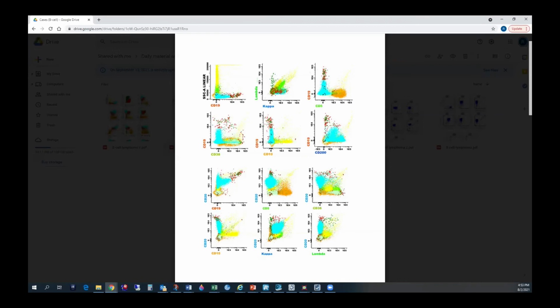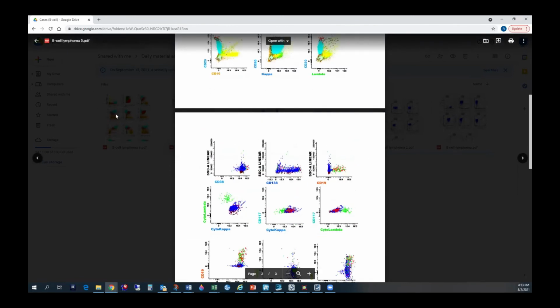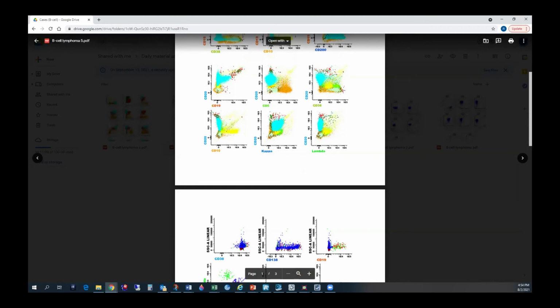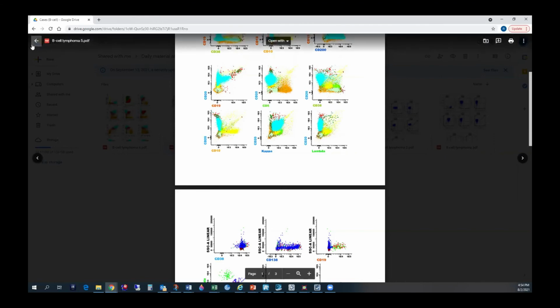Here, basically, the clue is it is CD20 positive, and it is light chain restricted. So you have a population of B cells and plasma cells. So it is an LPL. Obviously, you cannot say it is an LPL without MYD88. You can say kappa restricted B cells with plasmacytic differentiation. That's in your final report, but when we report this flow, we write two lines. One line of this percentage of kappa restricted B cells, and the second line of this percentage of kappa restricted plasma cells. That's how we report.